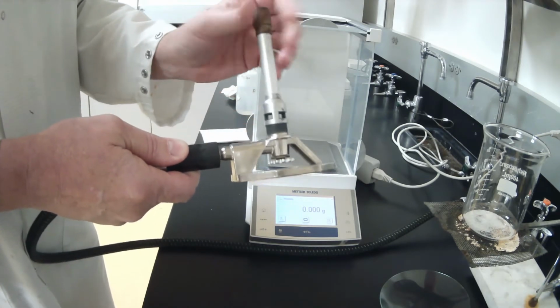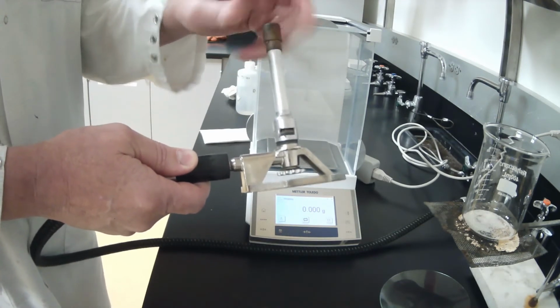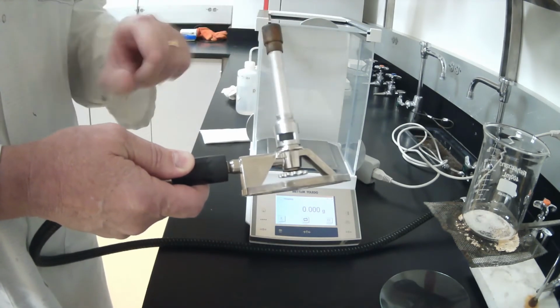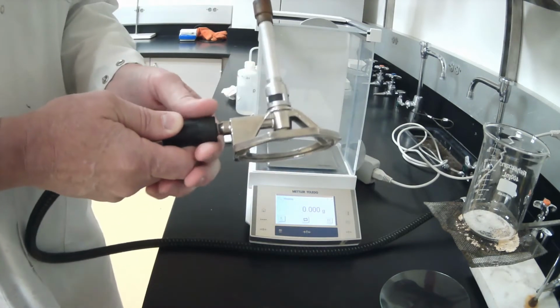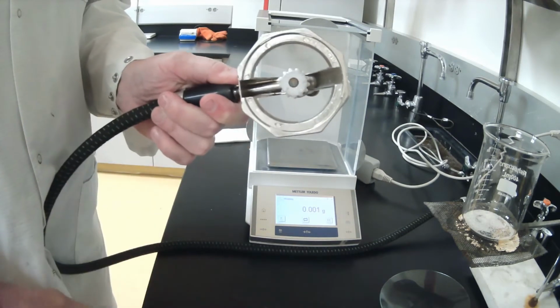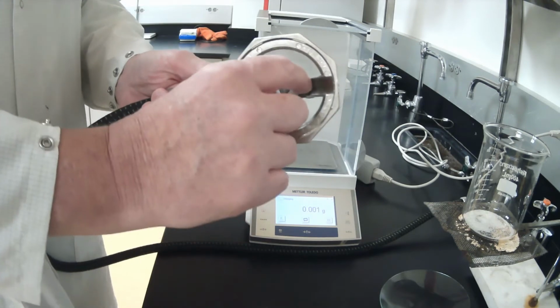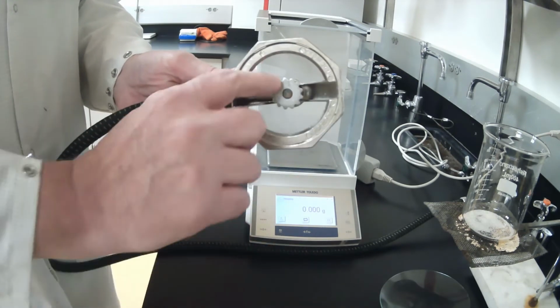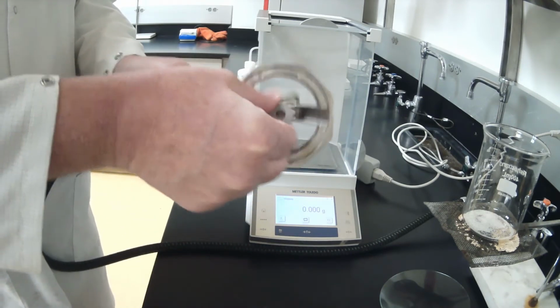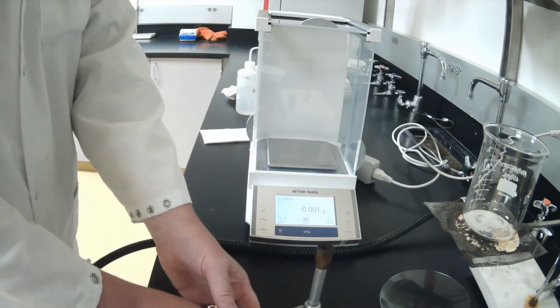Now the easiest way to light a Bunsen burner is to close off all the air. When you do that, it does not allow much mixing of air until it reaches the spout. It's a much easier flame to light. The other valve you need to use on a Bunsen burner is this needle valve. It controls the amount of gas that goes through the chamber. Again, the easiest way to light a Bunsen burner is first turn it off, or turn it clockwise, then turn it back 1 turn. Now that I've turned it back, we are ready to light the Bunsen burner.